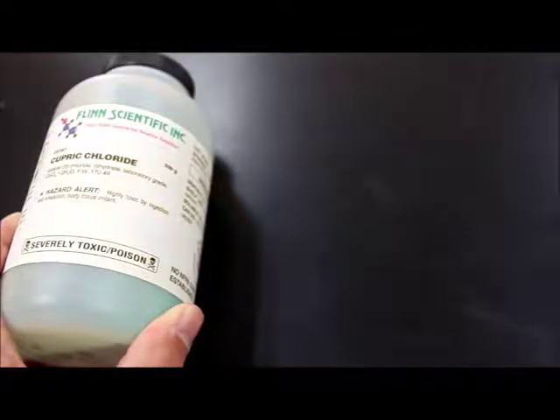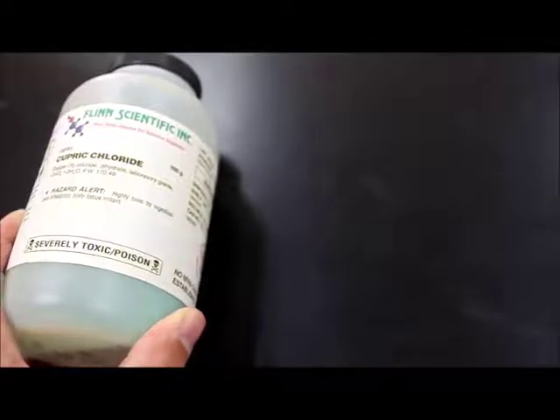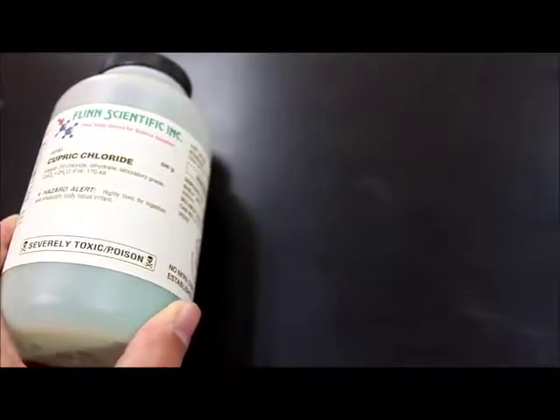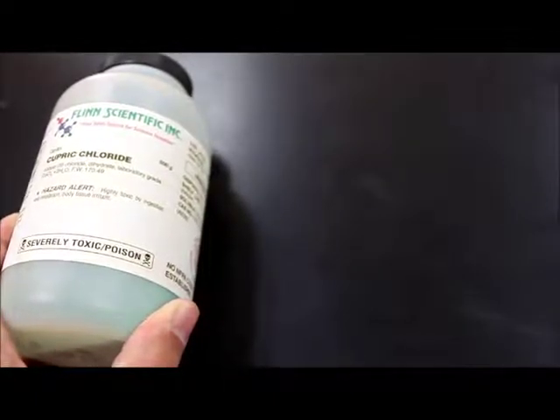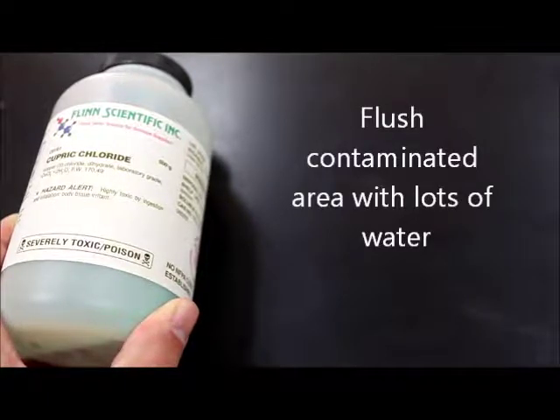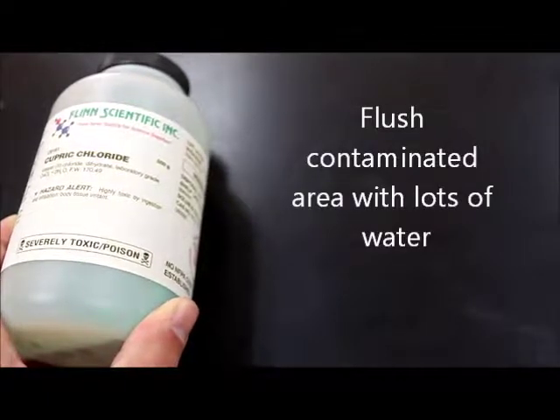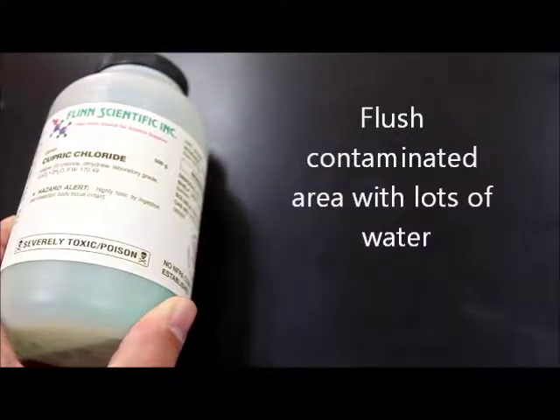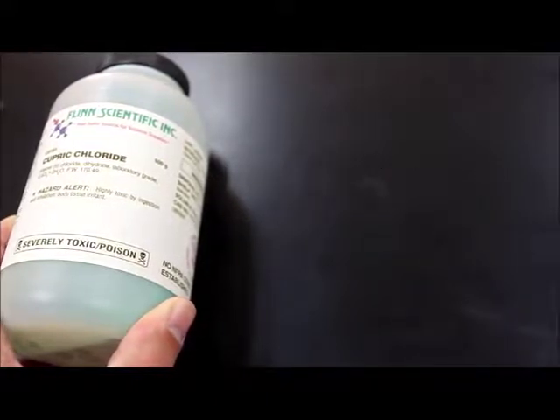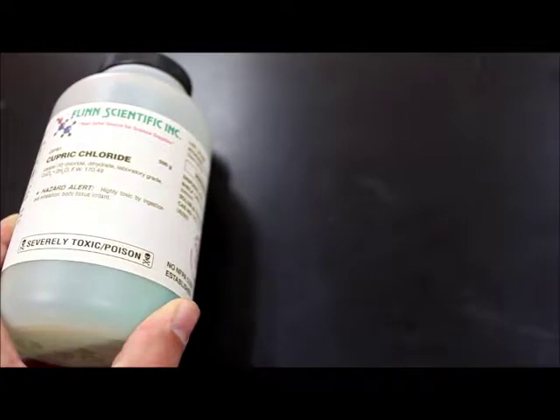You want to make sure that you keep anything that's an irritant far away from your eyes. So we're going to make sure that we have our lab goggles on at all times. But really the important part of this, wear your goggles. If you get any of this on your skin, the powder itself, or if you get any of the solution on your skin, then you run it under cold water for a long time. Flush that area with lots of water and you'll be just fine. So it's nothing really to be scared of as long as we're wearing our goggles.